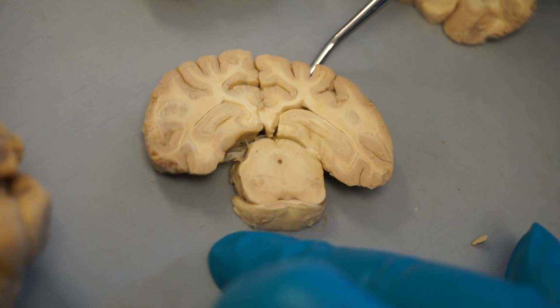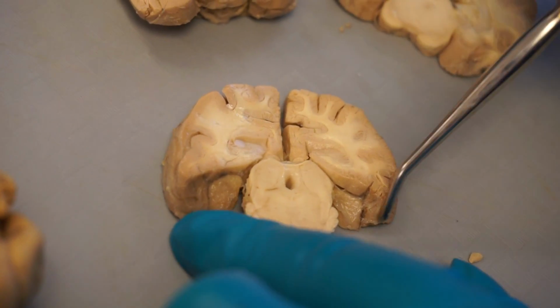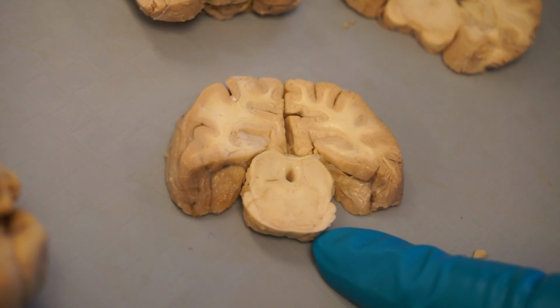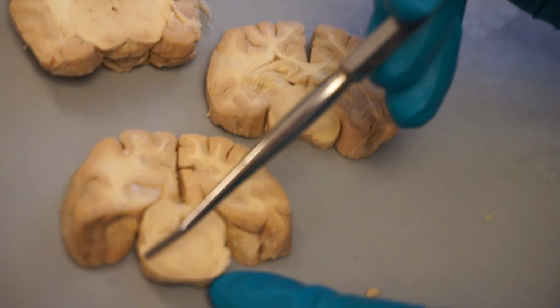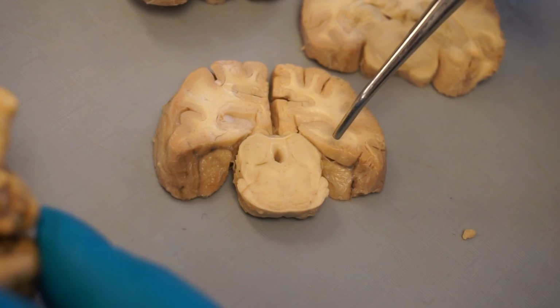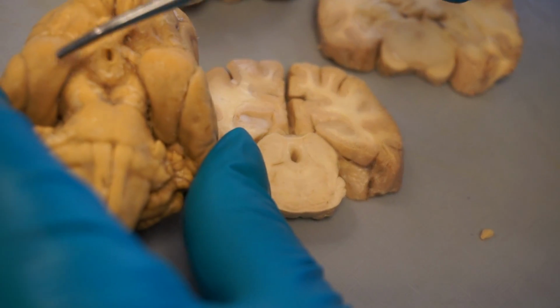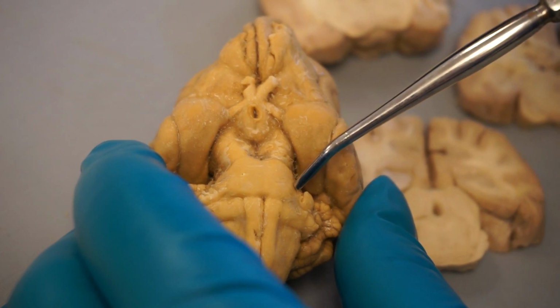So I'm going to turn this over. Now notice that instead of having the two bumps on the bottom, as we saw before, we have this very smooth curved appearance to the bottom. So we have transitioned from crus cerebri to pons.